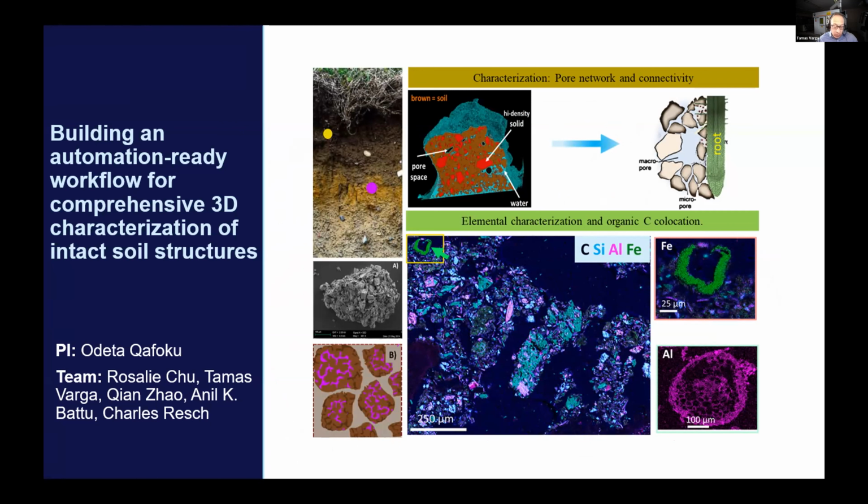As we mentioned, soils are very heterogeneous. You can see significant heterogeneity even in a soil core. So ideally, you would like to subsample that and look at some of the important hotspots within that core on the aggregate scale. These are larger aggregates in this project, about a centimeter in size.